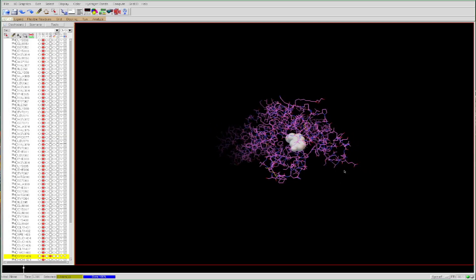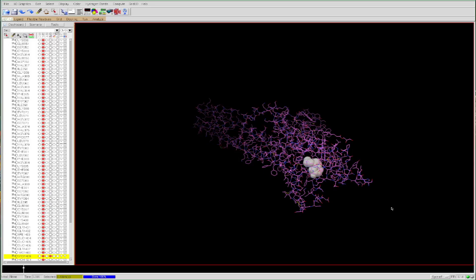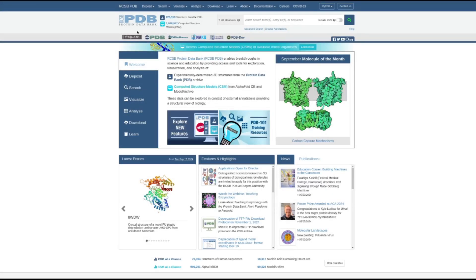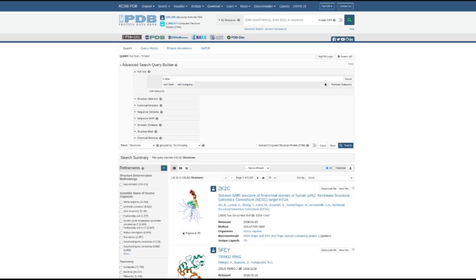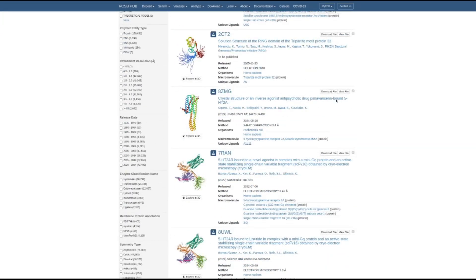Once you have AutoDock Tools installed you'll be able to open the program. Now to get started, I'll use an example of trying to determine the fit of serotonin in the 5-HT2A receptor. To do this we can use the Protein Data Bank website, which has a wide range of receptors and enzymes available for download determined by crystallography. We can search for the receptor we're looking for — in this case we search for 5-HT2A and see a range of proteins.